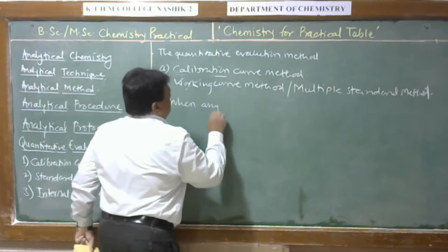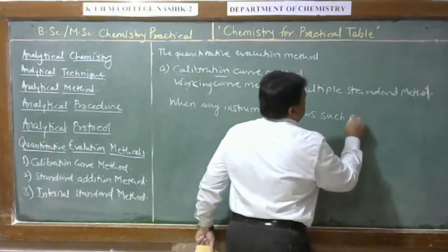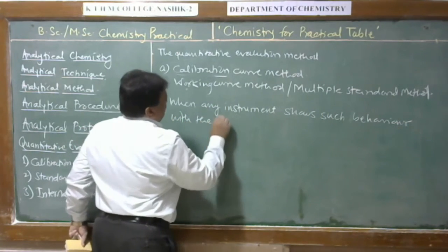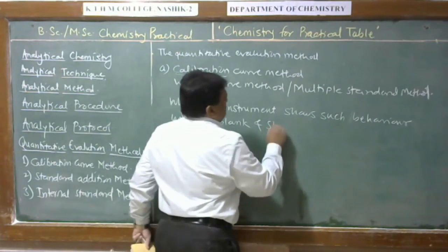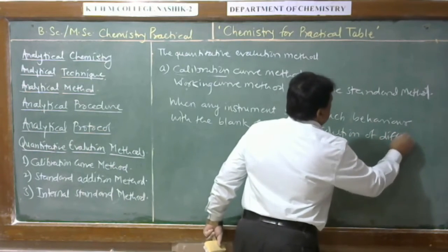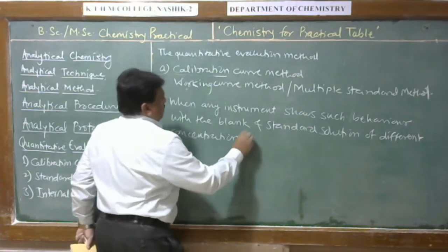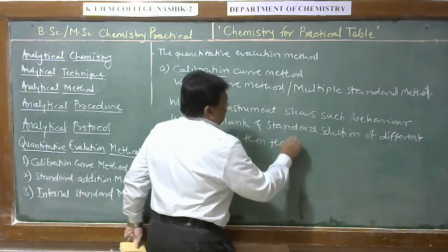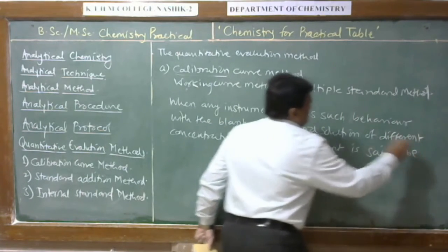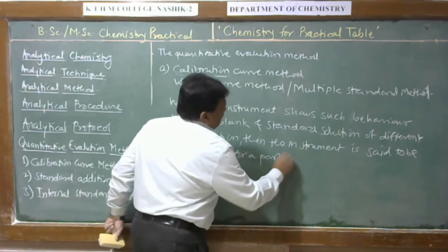When any instrument shows such behavior with the blank and the standard solutions of different concentrations, then the instrument is said to be calibrated for a particular analysis.